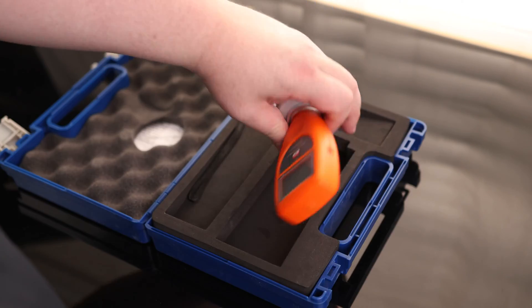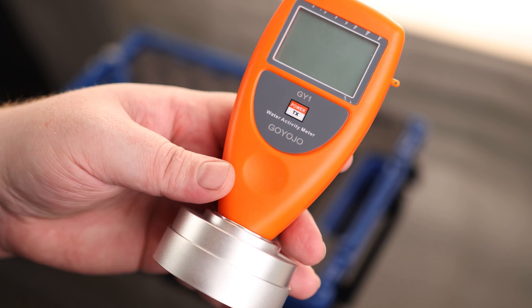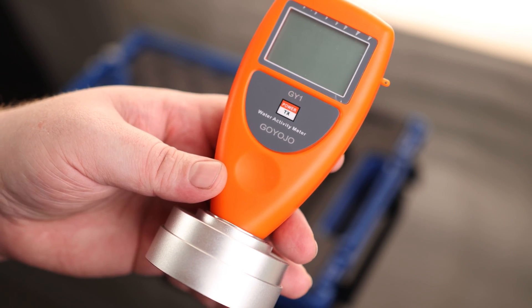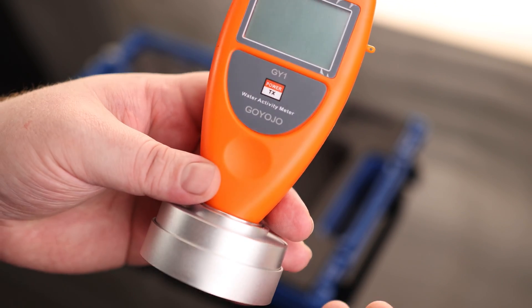Today I'll take a look at the water activity meter. This is our water activity meter — nice small thing. I like that this one is actually portable. Most of the time when you're testing water activity, you're going to have this big bench top tool that you can't really move around. With this thing you can take it right with you.